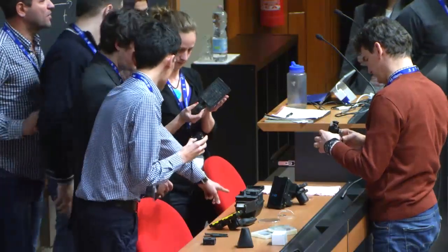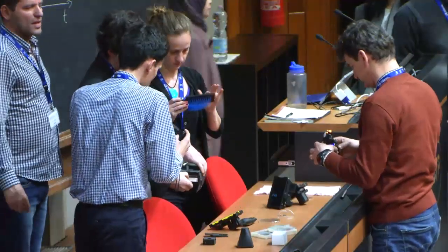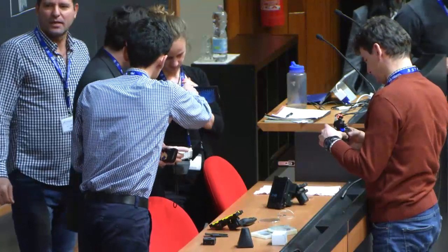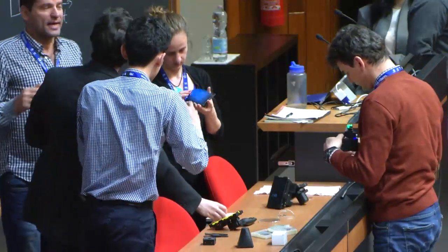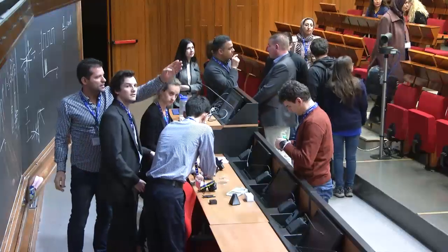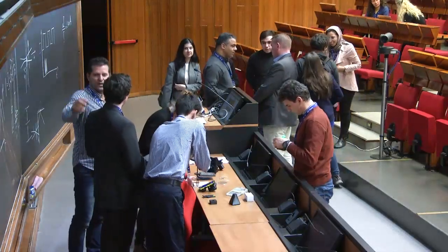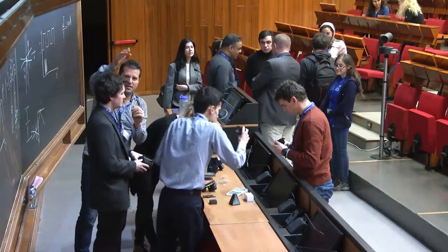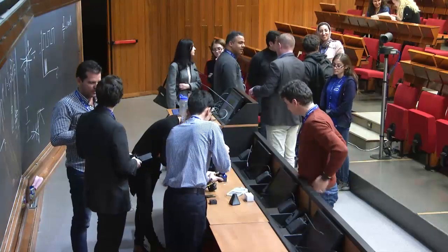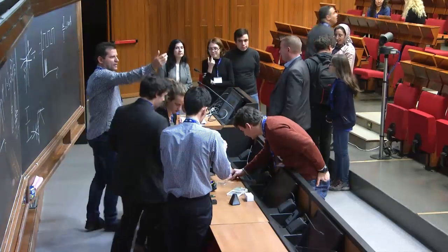Let's go to the lab. Wait for me in the lobby. No. This is an ELISA well plate reader. Wait for me in the lobby. Okay. That's the SPR reader. ELISA reader. Yes. A person that is recording says that we should look at this camera and this camera. We will try for no student to be here, or here, or in this angle. This angle to be free. Take care that the microphone is working. Okay, we'll change the group now.